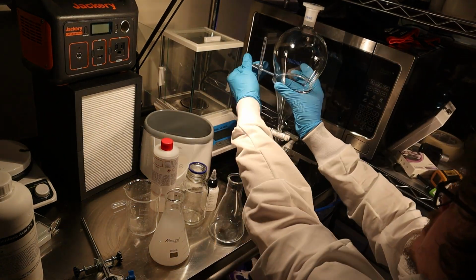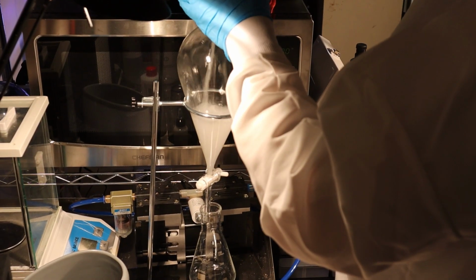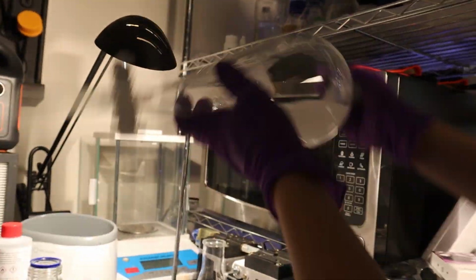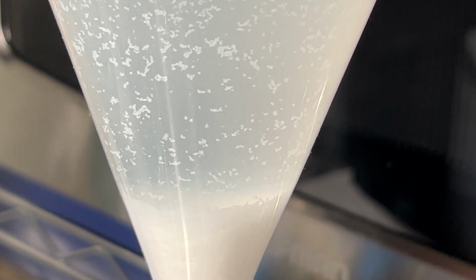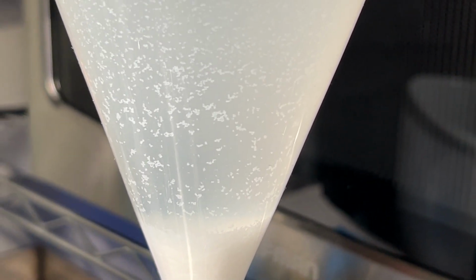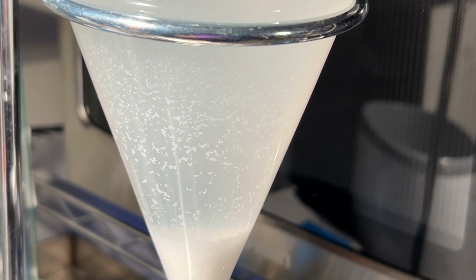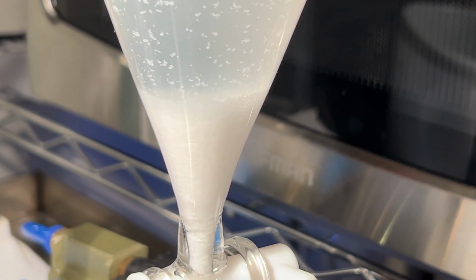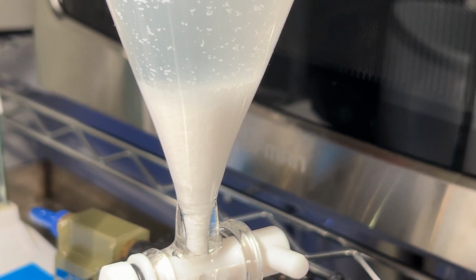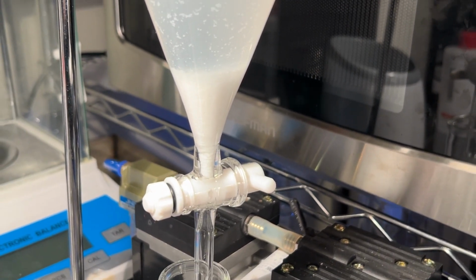We then set up a 1 liter separatory funnel and poured everything in. I then mixed it up and let it settle. This is such a big optical zoom, so I'm using a phone for this. I don't have a fancy macro lens. Wow, phones are pretty good actually these days.